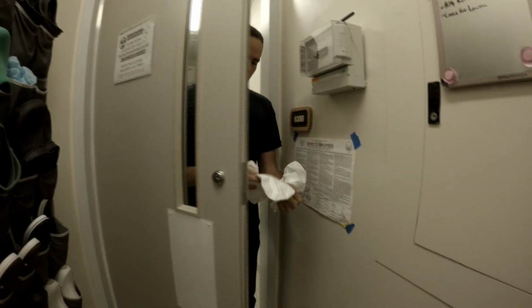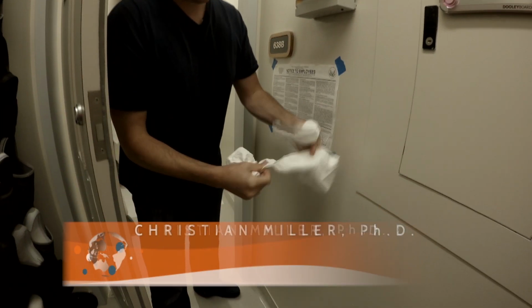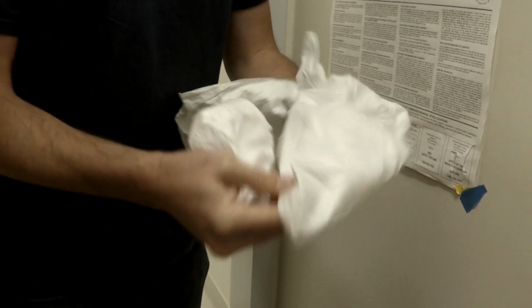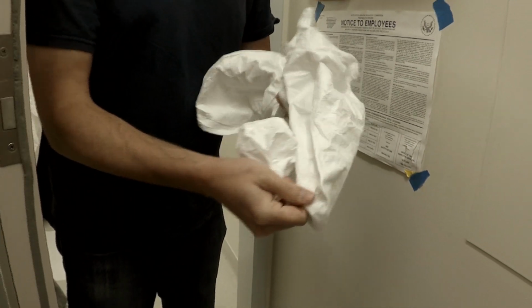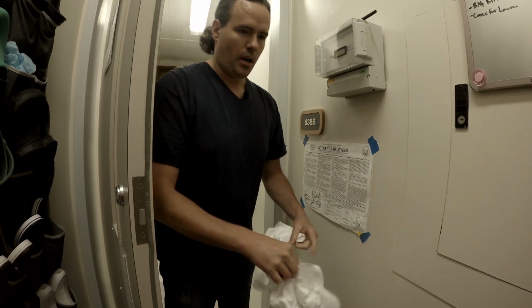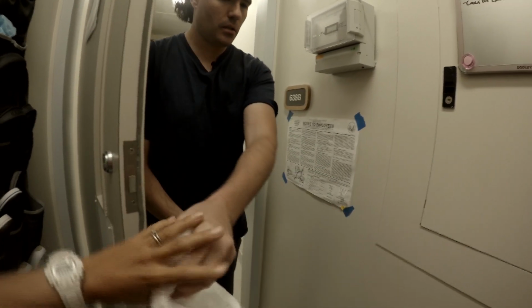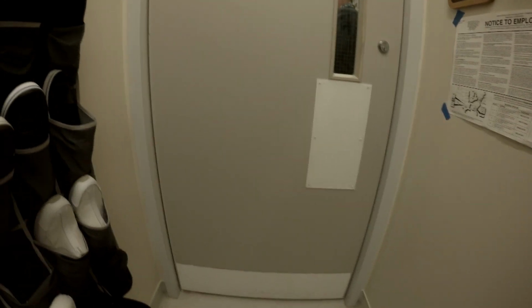You guys, when you're ready to step over onto here, you can put your feet inside some of these. One thing to be aware of is that the floor can be slippery when you're wearing them because there's very little grip. So there should be a pair for you. Thank you. And a pair for Kenisa. Thank you. Then we just go through there. Usually just put these on over your head. Yeah.